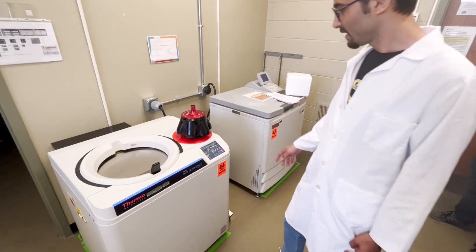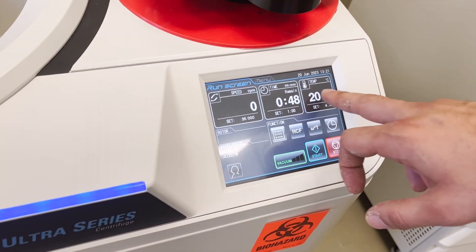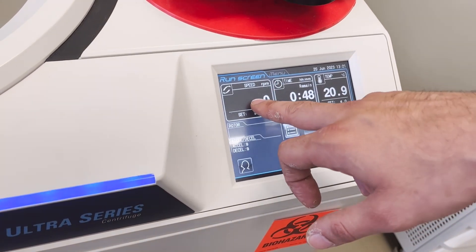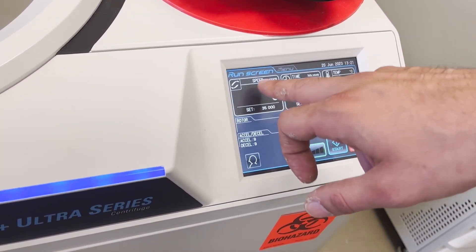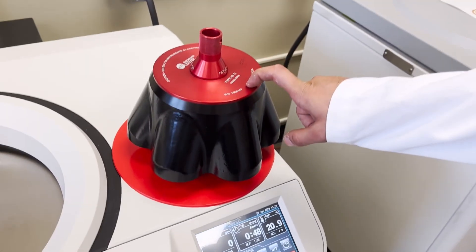The settings are easy — you only have three things: speed, time, and temperature. The speed is the main thing that matters, and it depends on which rotor you are using.